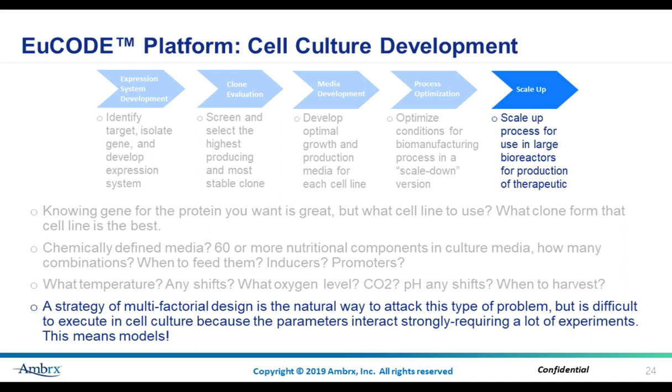Agitation is adjusted to provide sufficient mixing and oxygen mass transfer, and is generally scaled using specific energy dissipation rate, whereas aeration is modulated for appropriate supply of oxygen and the removal of excess CO2.